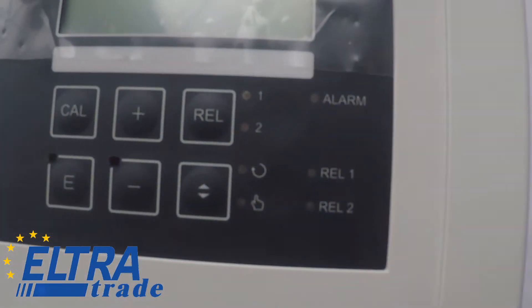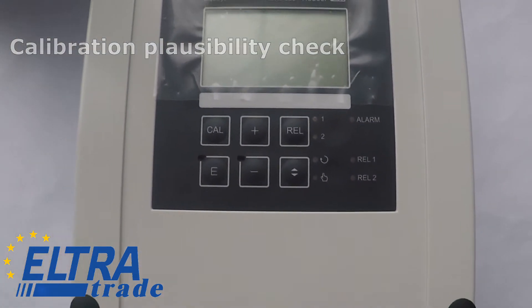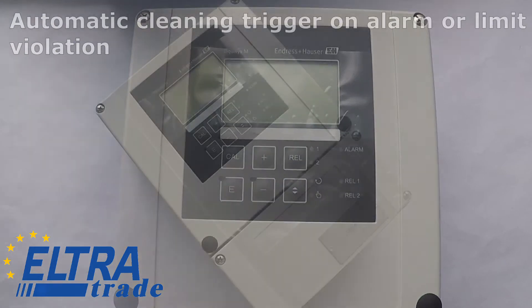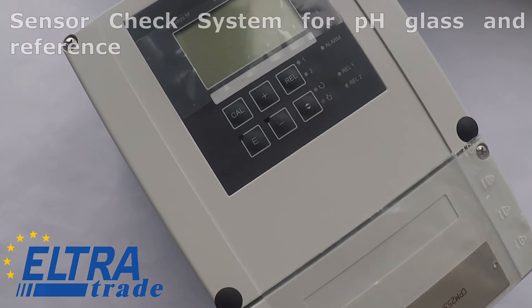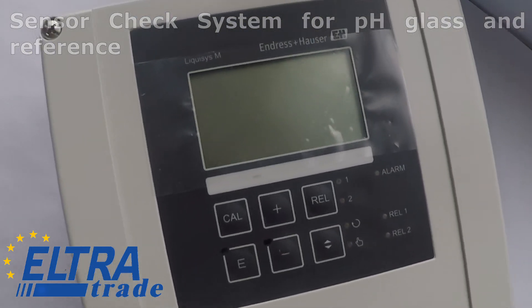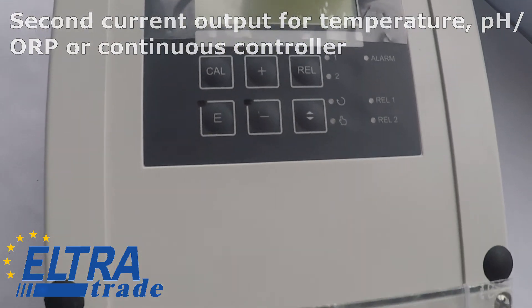Benefits of the sensor: ultra simple two-point calibration, calibration plausibility check, automatic cleaning trigger on alarm or limit violation, sensor check system for pH glass and reference, second current output for temperature, pH/ORP or continuous controller.